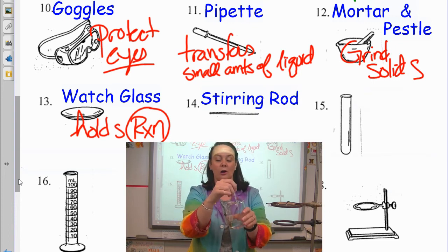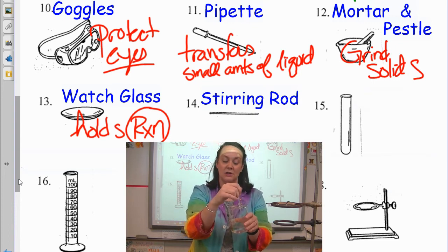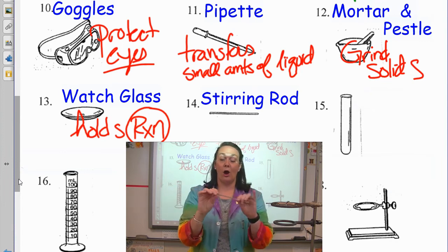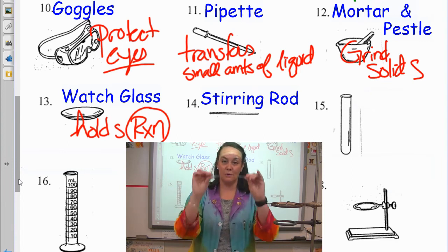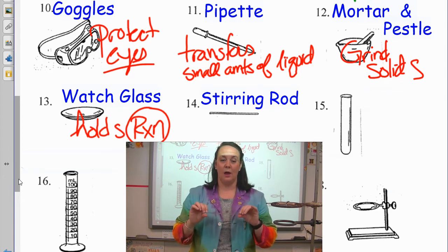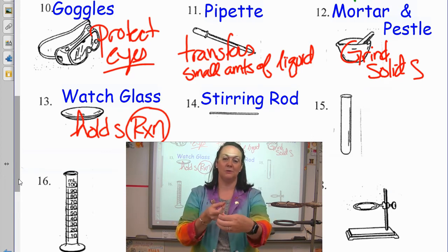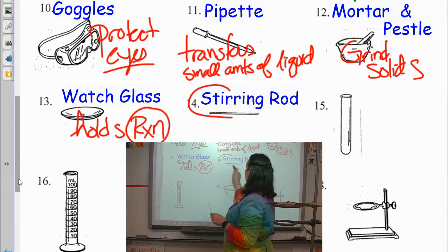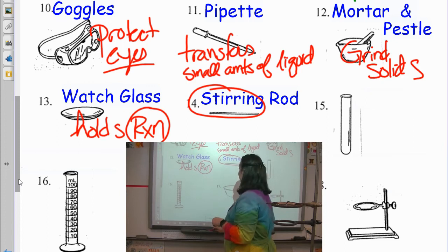If we're trying to dissolve sugar or dissolve something in a solution here, you always have a stirring rod. They are glass, so you want to be very careful with them. When you put them down on a countertop, don't put them parallel. You always want to put it perpendicular because they do love to roll. So, it is for stirring. That one's a tough one.